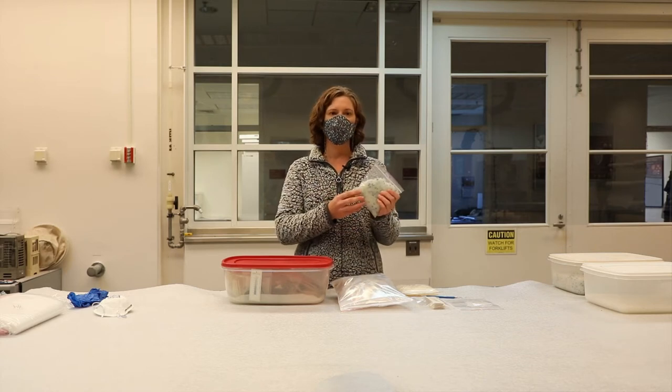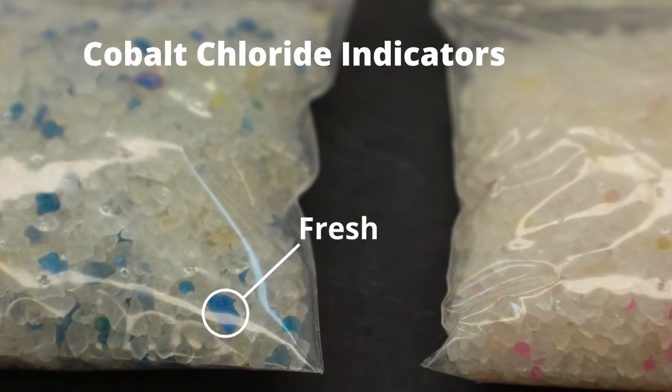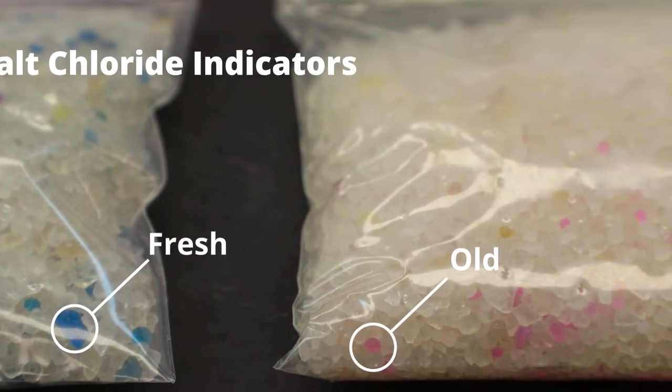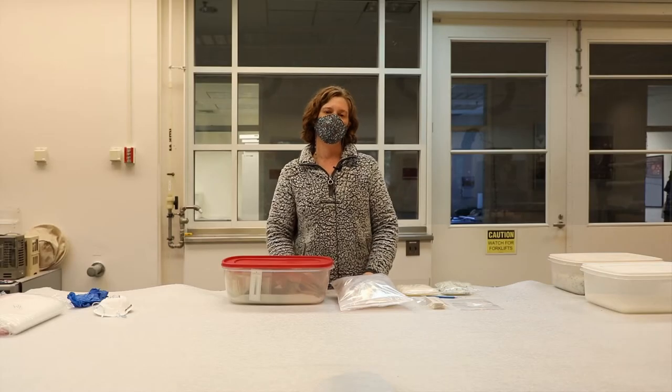The cobalt chloride is a very popular color indicator and it ranges between blue to pink, but it is a carcinogen, so always handle using a dust mask and gloves. A more environmentally conscious alternative is the orange indicating beads, which turn to green. They are both non-toxic and pollution-free.